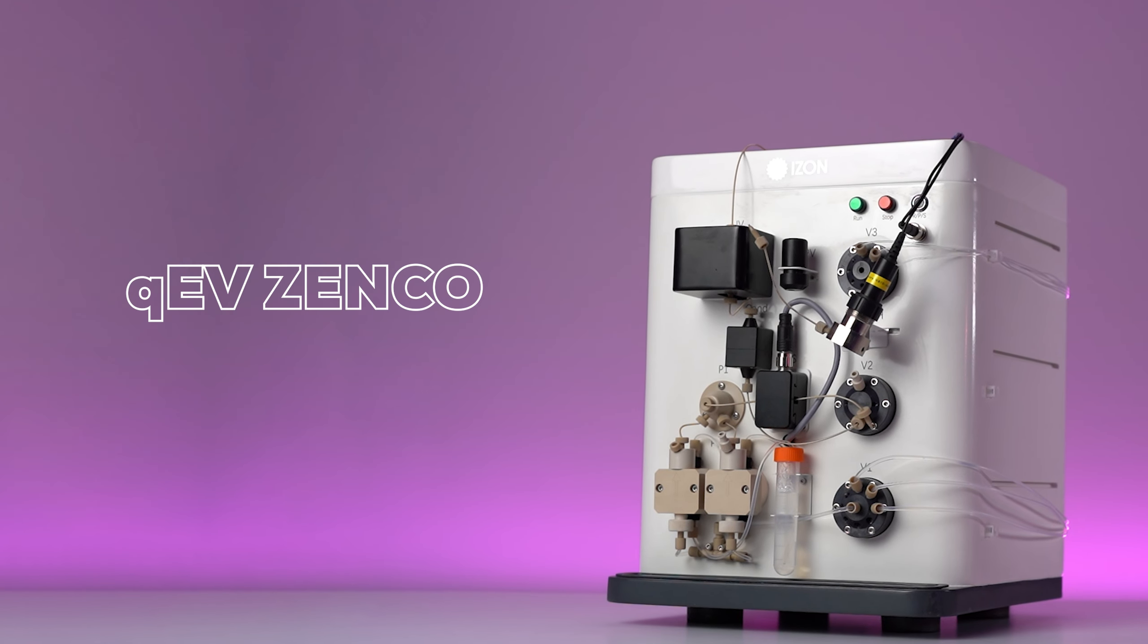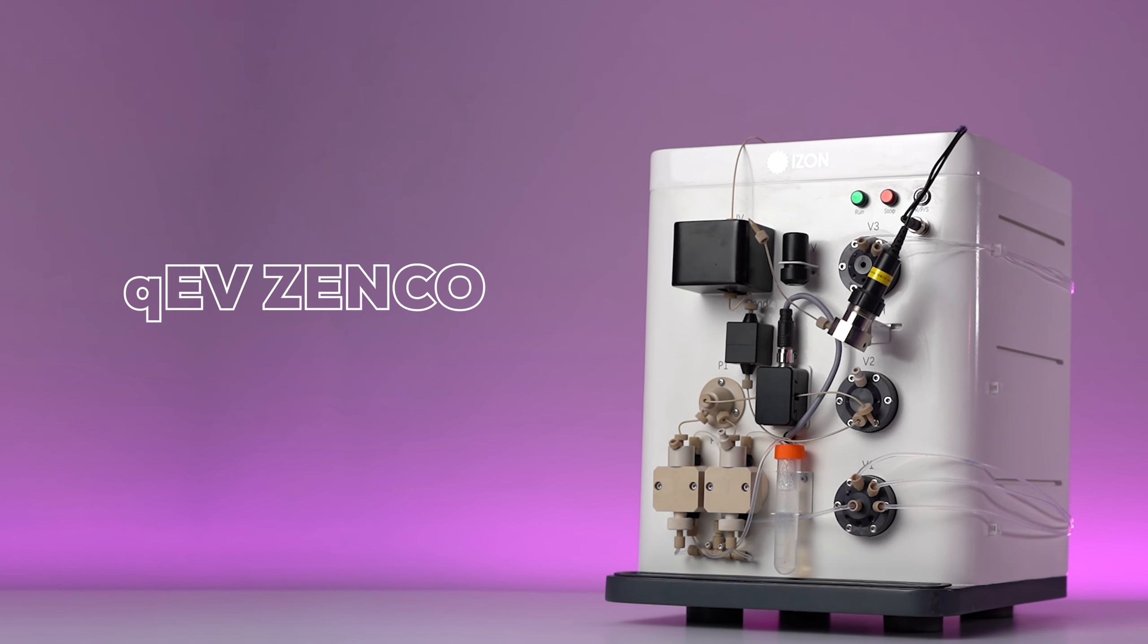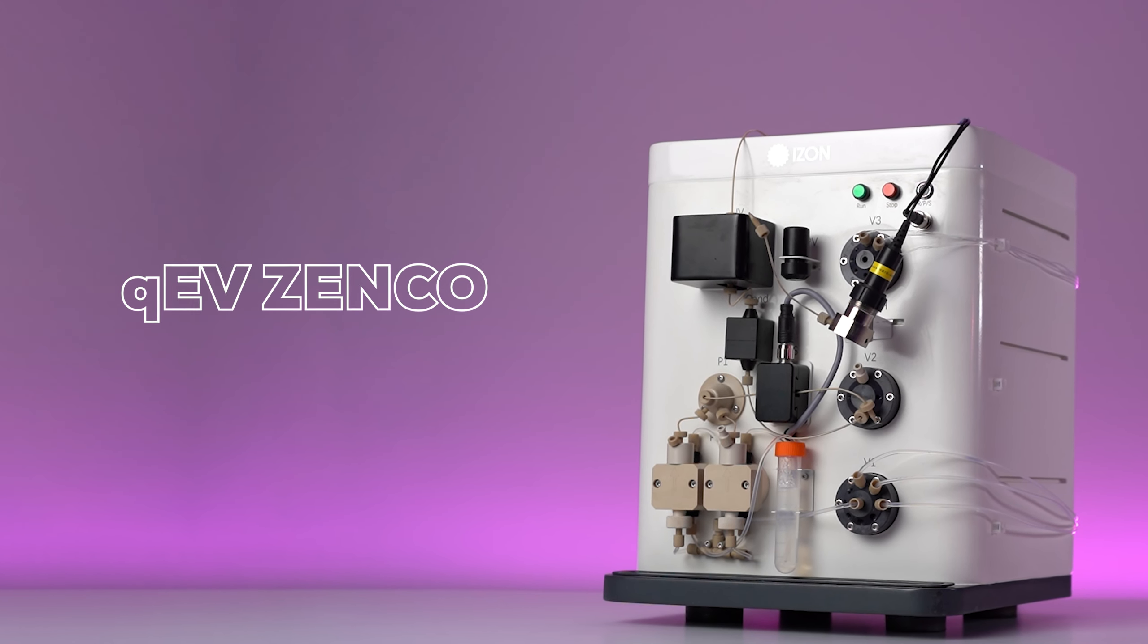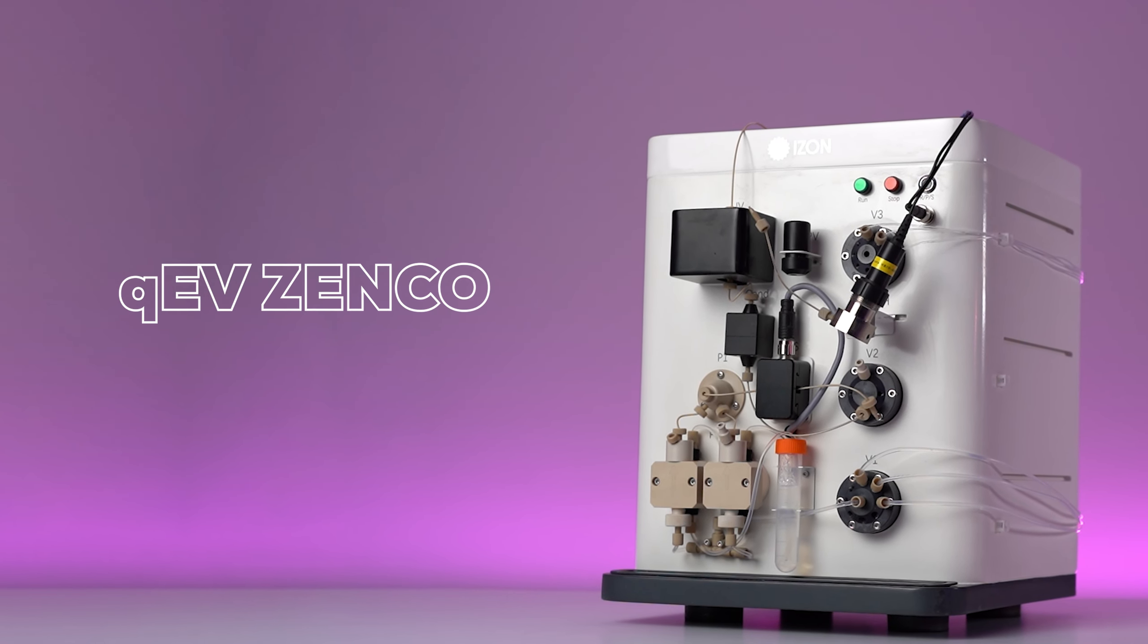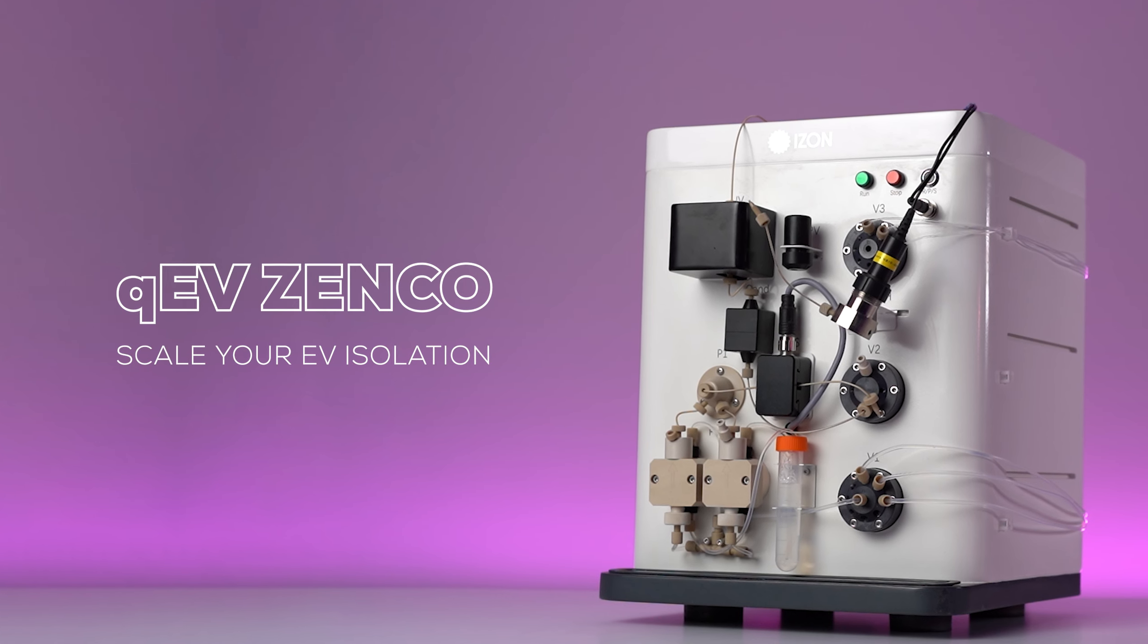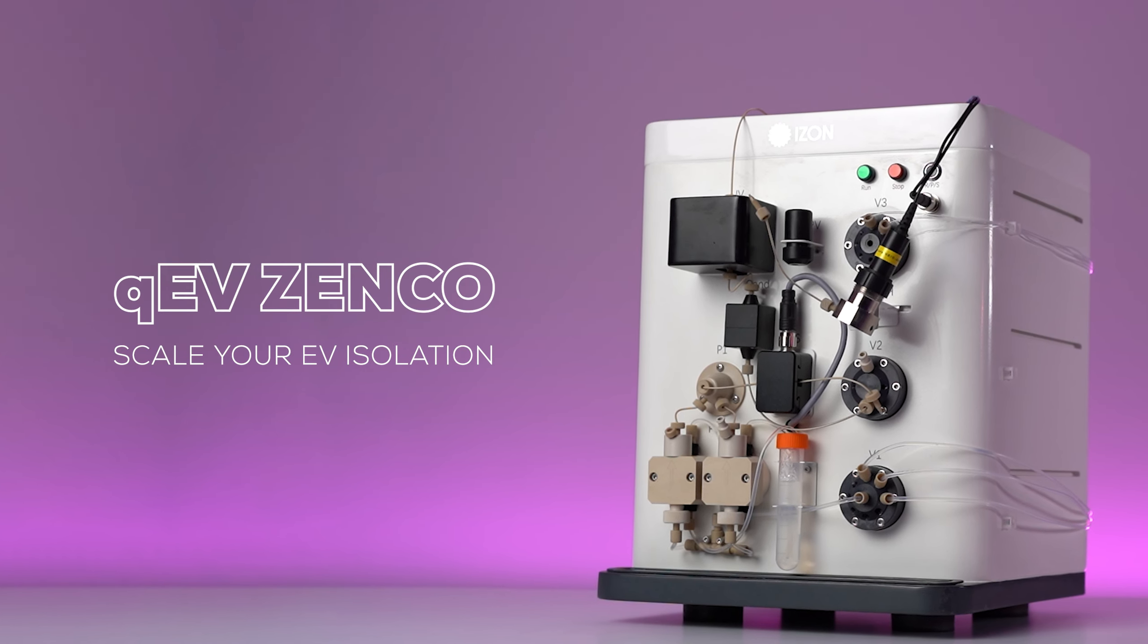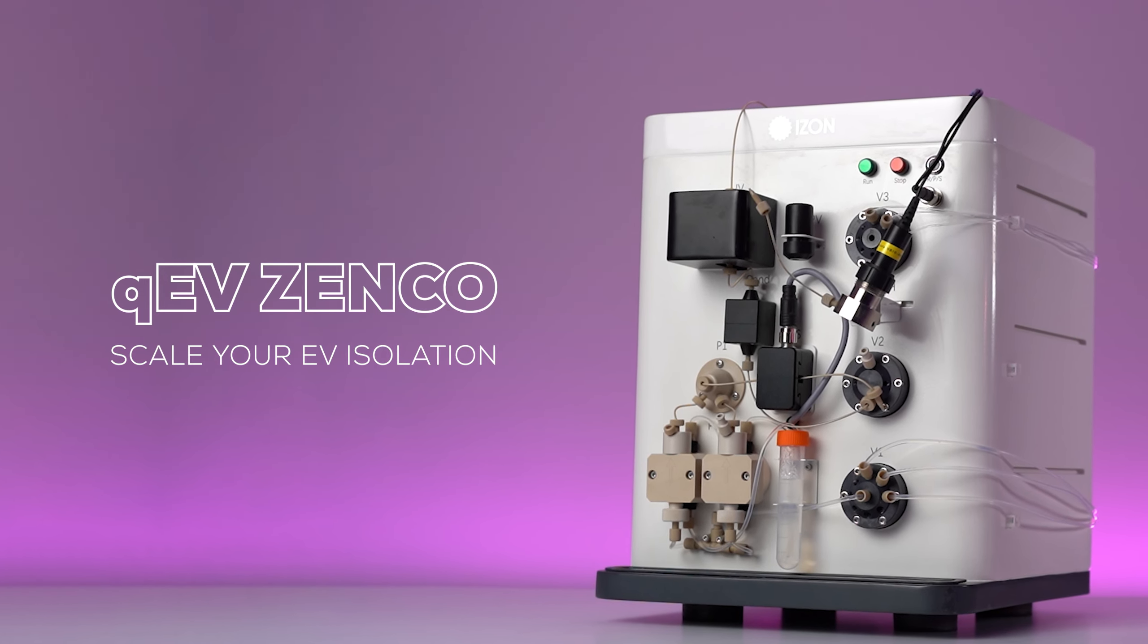Welcome to the qEV Zenco, IZON's automated chromatography unit designed for scaling nanoparticle isolation.